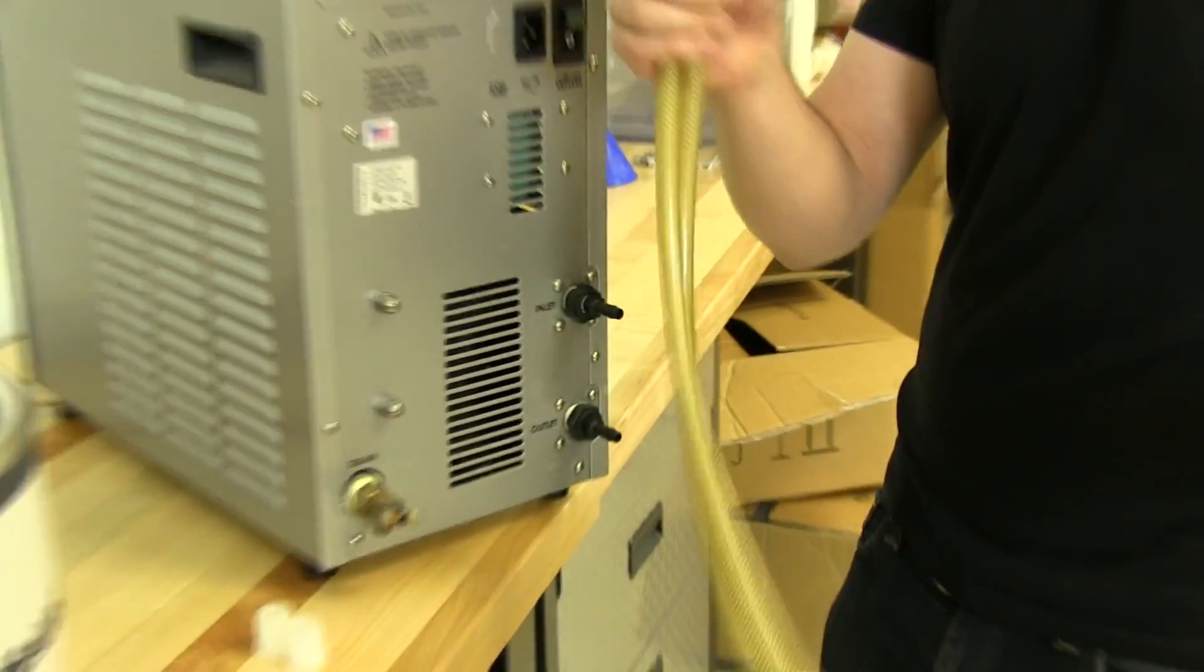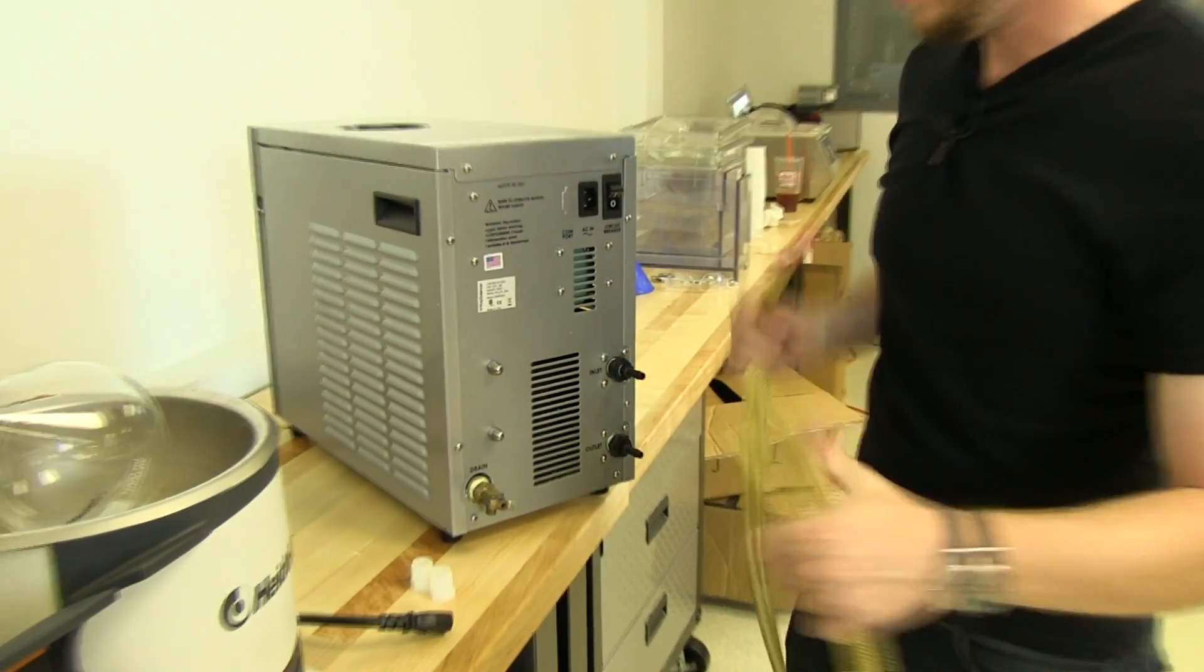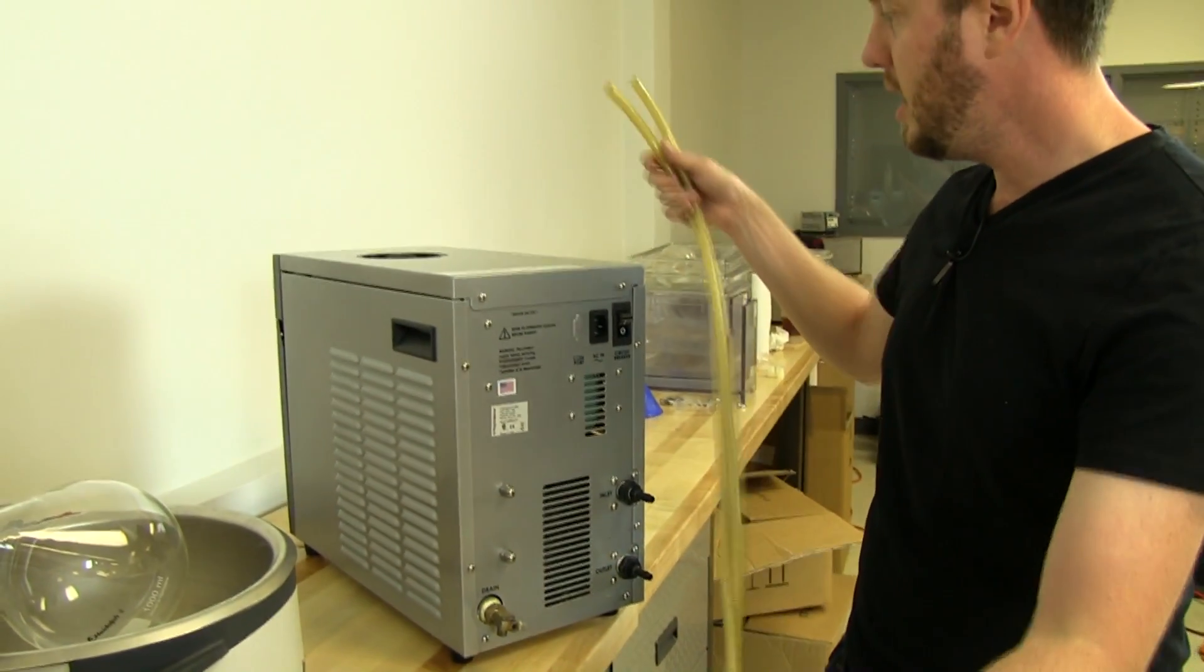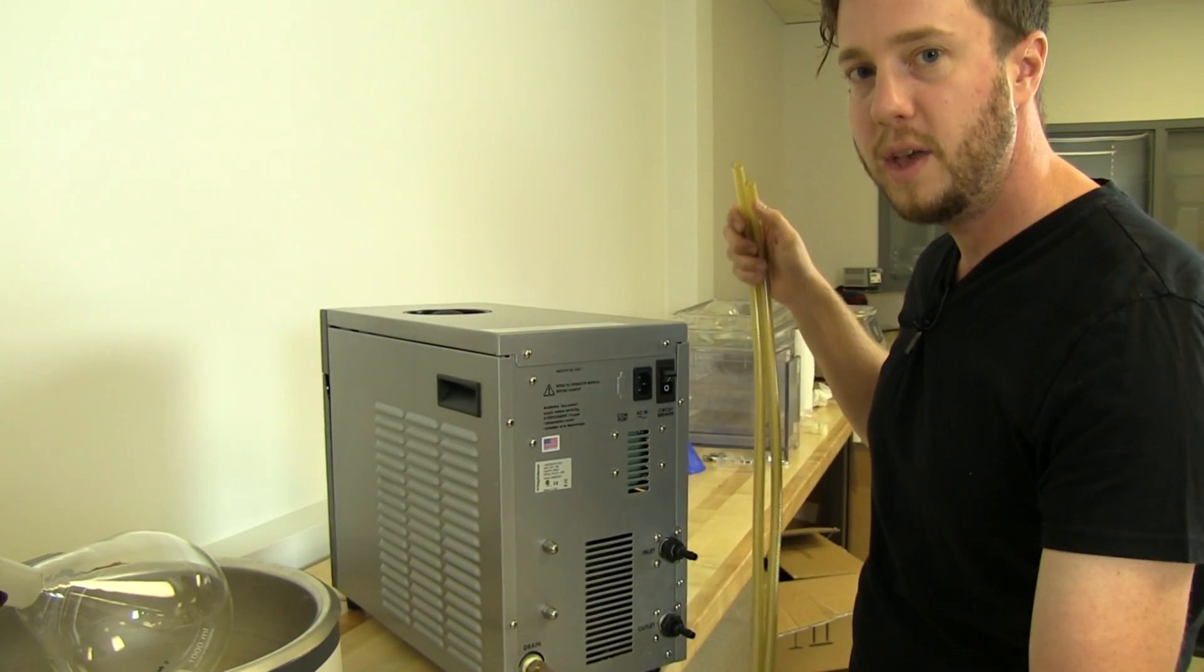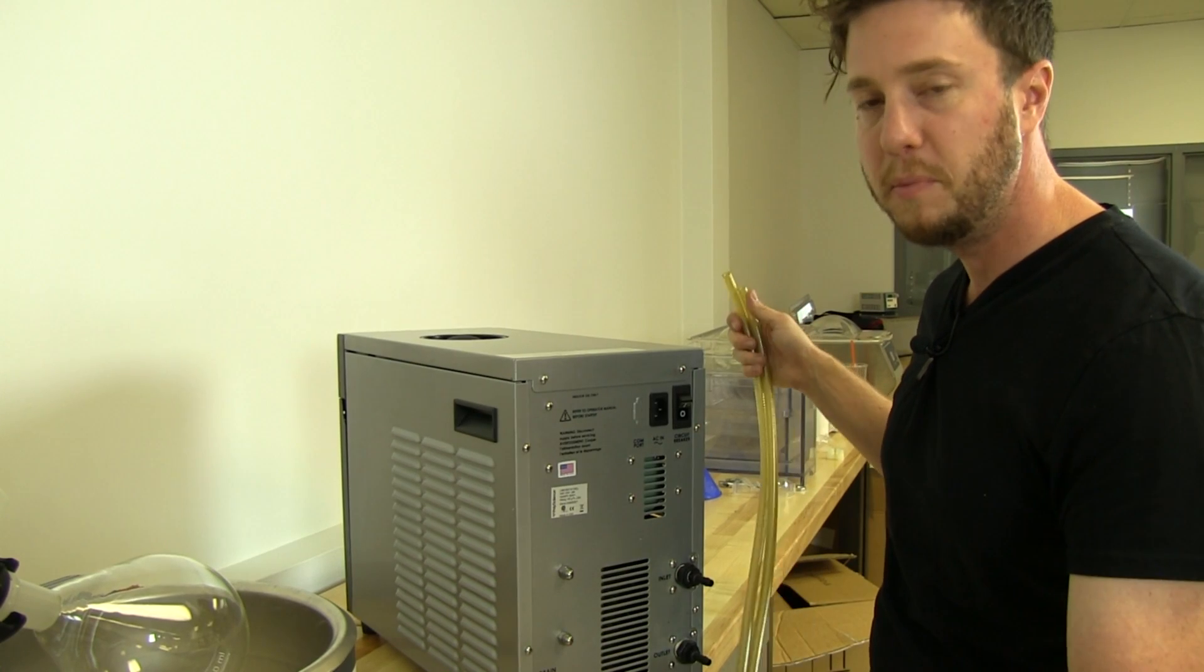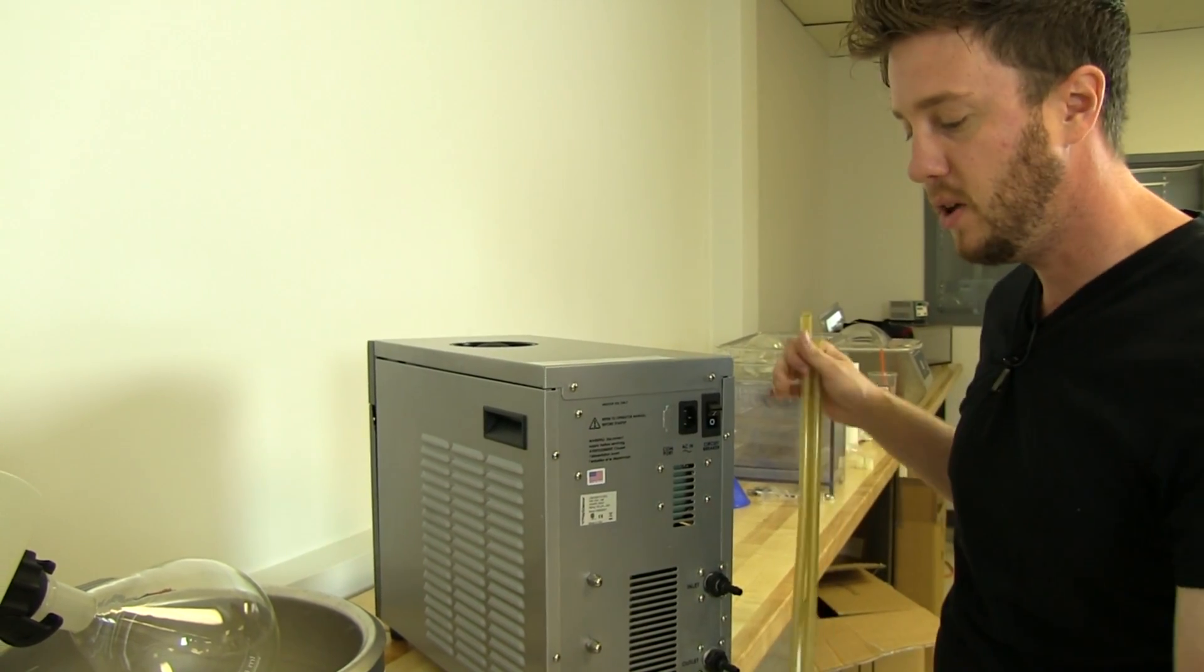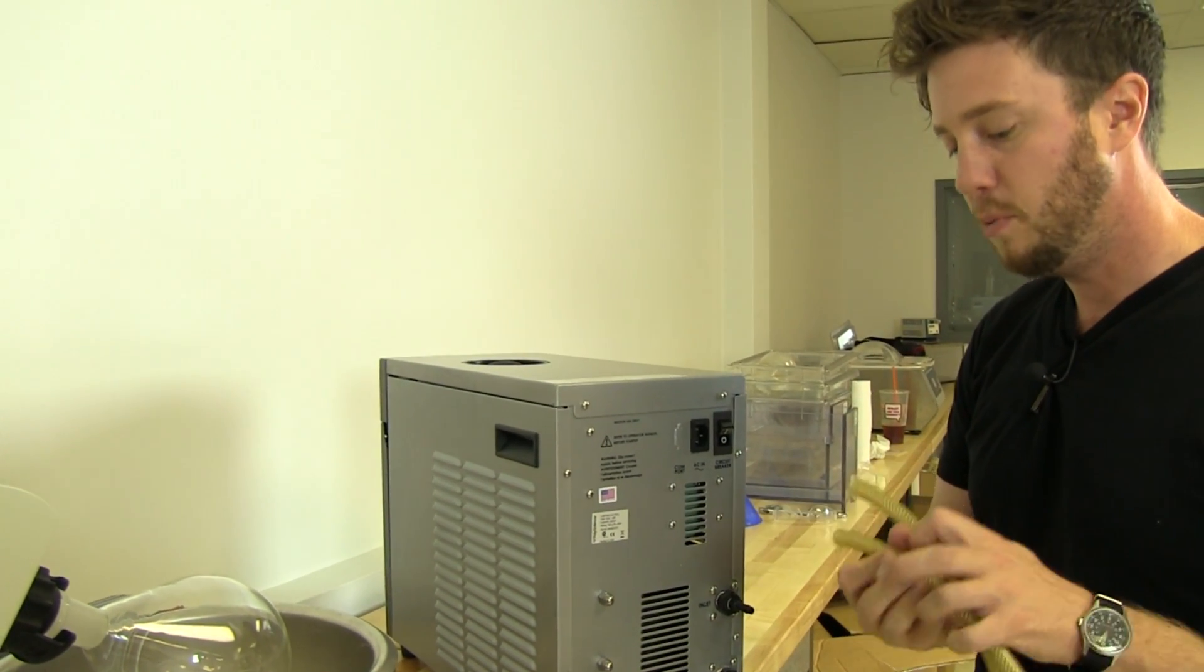We have our chiller tubing, cut to equal lengths, and we're going to connect either one. You don't want to have this more than a meter or so, or a couple meters, so the chilling process is much more efficient. If you have a great length, it really slows down the whole process.